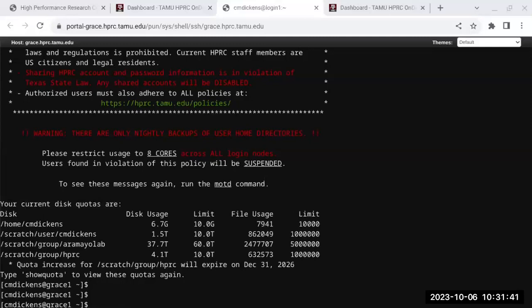All right, so I mentioned you can have a combination of long reads and short reads. So if you have PacBio sequencing data and you follow up that project with Illumina reads, then there are assemblers that you can use to use both of these types of sequencing technologies. SPAdes, MaSuRCA, and Unicycler: generally you will build an assembly using the Illumina reads, and then you'll use the PacBio to verify the assembly and maybe to join contigs.